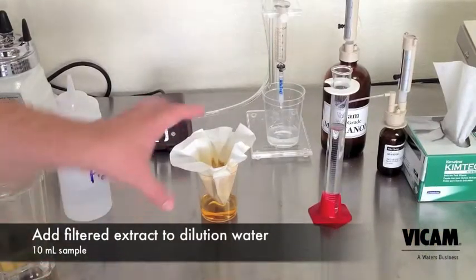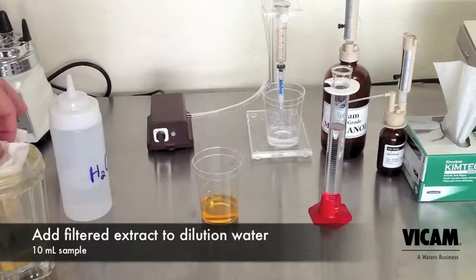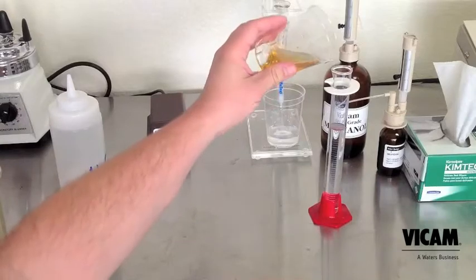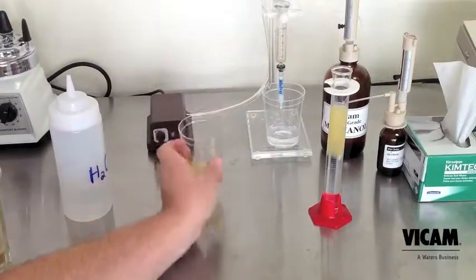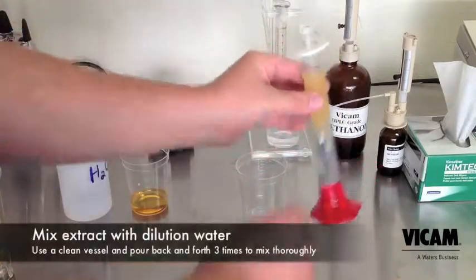Now that our sample has been filtered, add 10 milliliters to our 40 milliliters of purified water to dilute. Mix the dilution by pouring back and forth into a clean vessel three times.